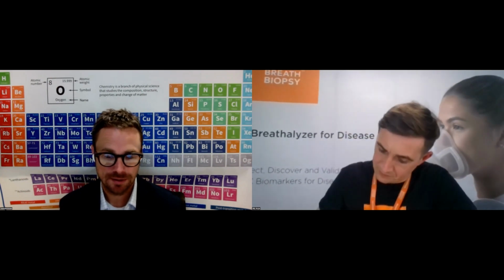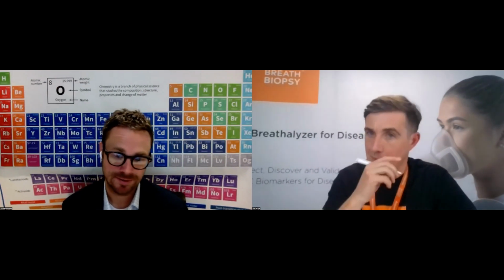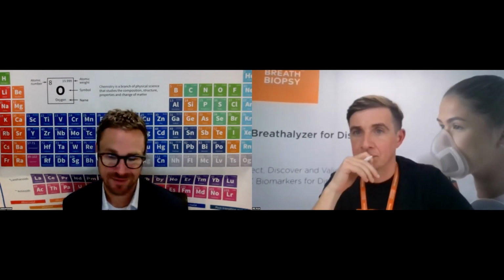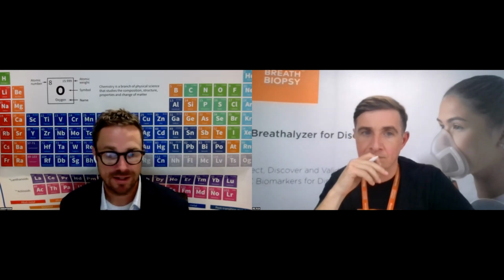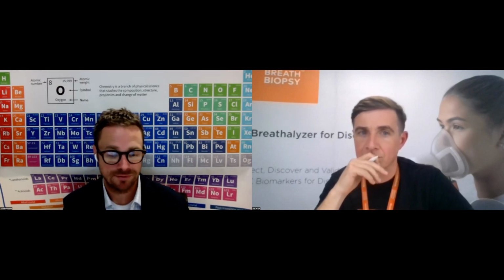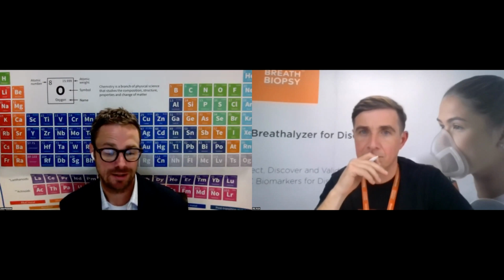Yeah, so we have done a lot of work on food. Not only are we working on developing a library of food-related volatiles, the idea there is we take the headspace above food. While I understand there's metabolism that's plausibly involved with all of that, oral microbiome, a lot that could go on there, we're trying to make a database of food-related volatiles, so kind of headspace analysis. And then we also have very similar work, where we will give individuals those foods and see what volatiles are present, and see how long they persist in their breath, right?